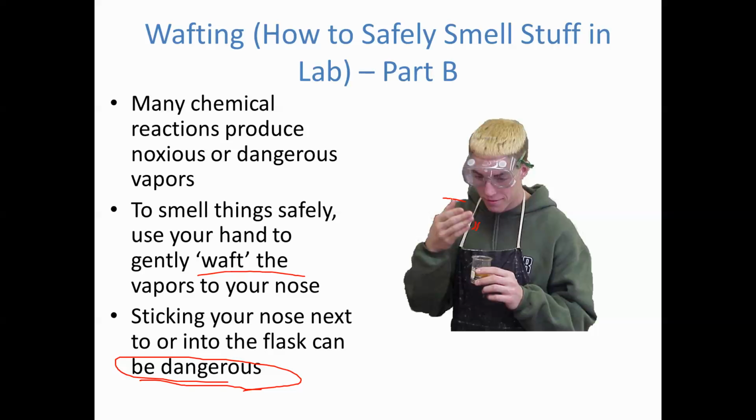I'll draw some motion lines here, like a comic book, and you see his hand is moving in the picture, and he's just gently blowing and moving and paddling those vapors up close to his nose until he gets the smell. So again, don't stick your nose close to those reactions. Some of the vapors in the reactions in part B can be pretty unpleasant, maybe even poisonous in high concentration. So just be very gentle in terms of wafting them towards your face, and then you'll be just fine.